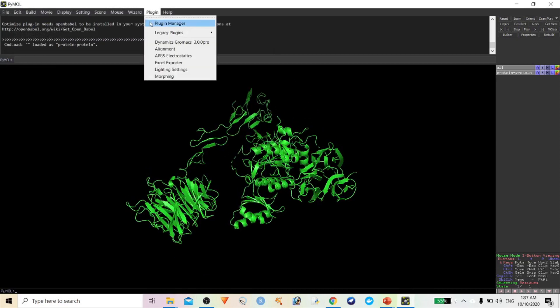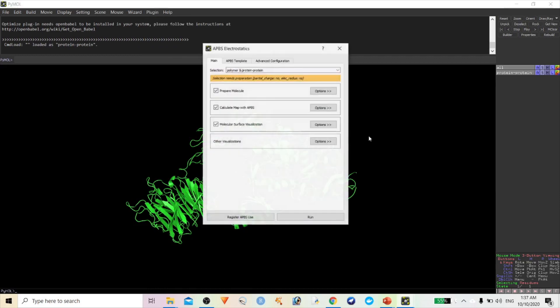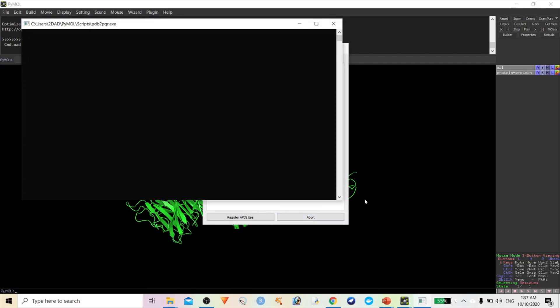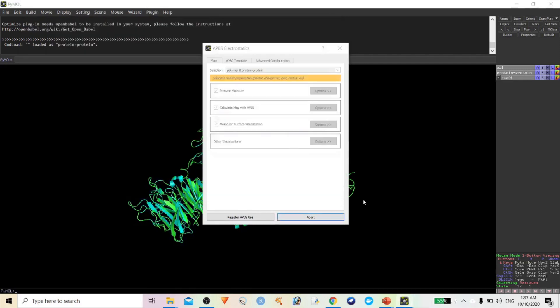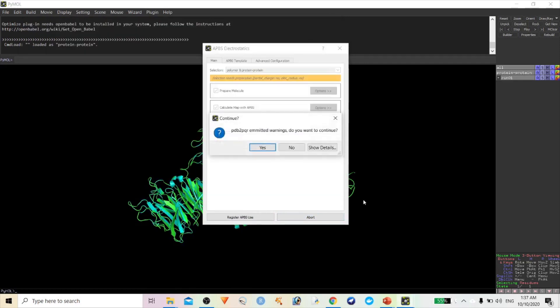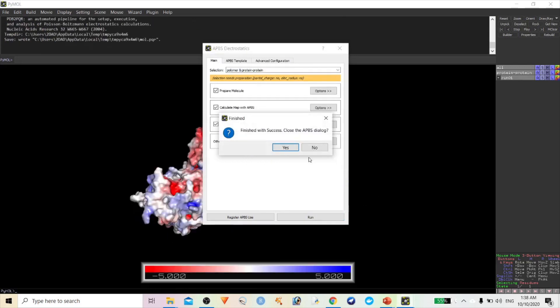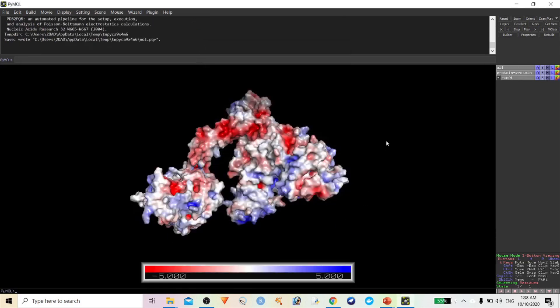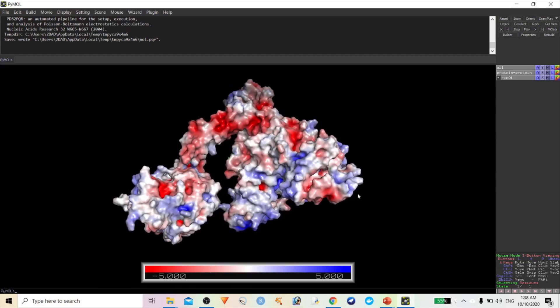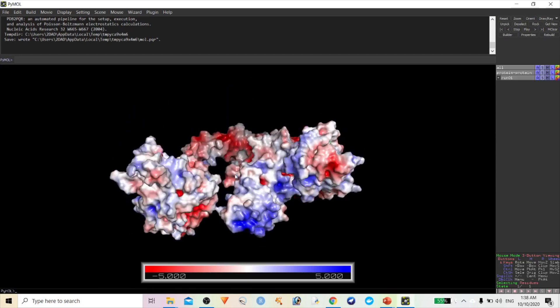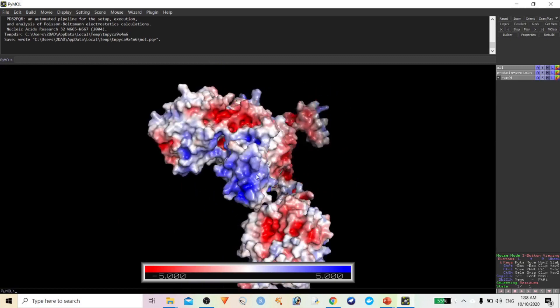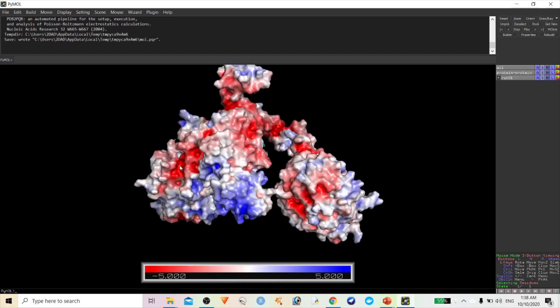Click on APBS Electrostatic Potential. No need to change anything — just click Run. Depending upon your system configuration it will take some time. Once completed, you can see the electrostatic potential of your protein.